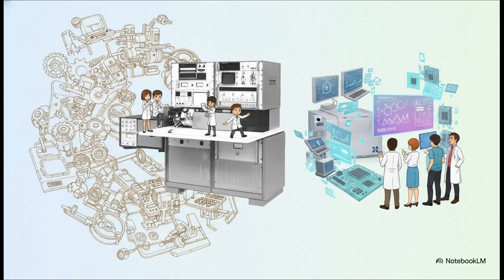We went from vintage, room-filling pieces of equipment in the early 70s that required specialized knowledge just to keep them running, to sleek, integrated, modern benchtop units. Engineers actually figured out how to put the mass analyzer inside the vacuum diffusion pump, miniaturize the electronics, and hand all instrument control over to powerful personal computers. They minimized the required lab space without sacrificing a single drop of analytical performance, taking this tech from a really niche specialty to an everyday essential for scientists worldwide.